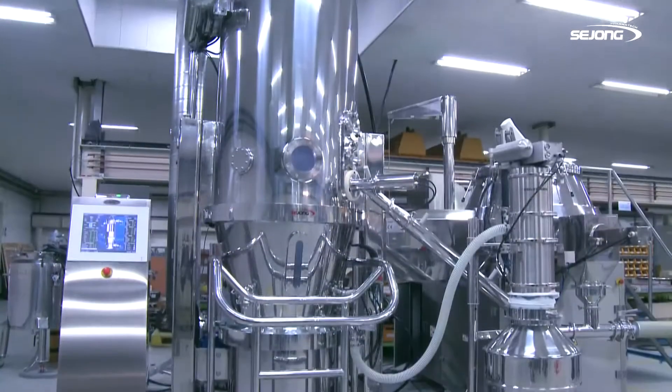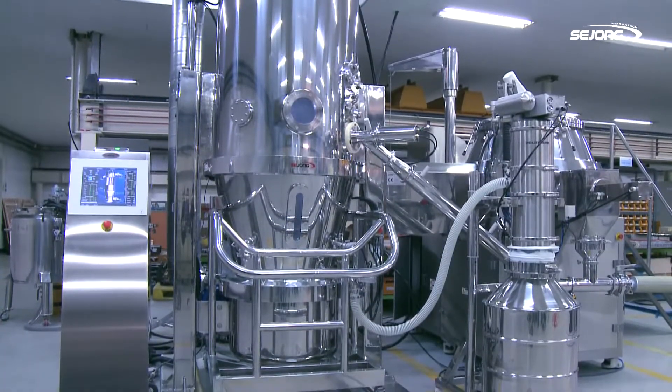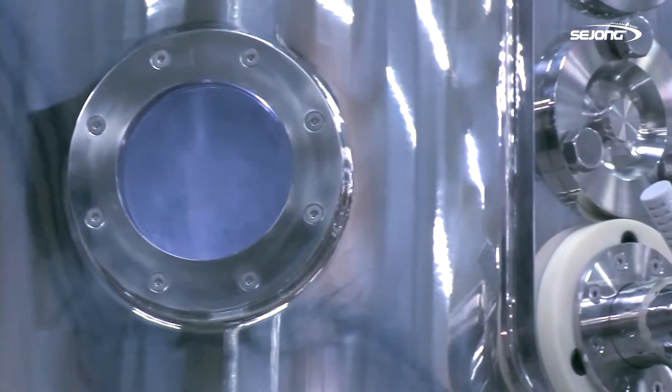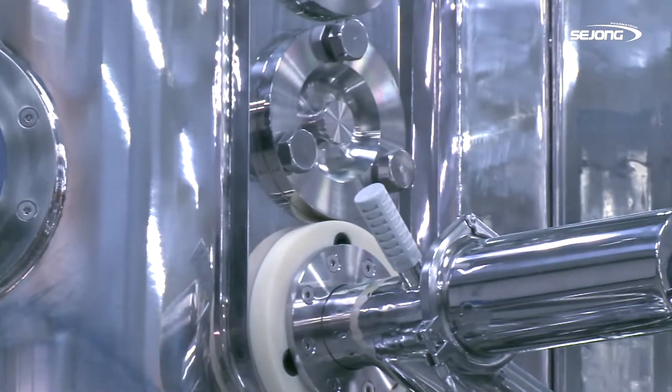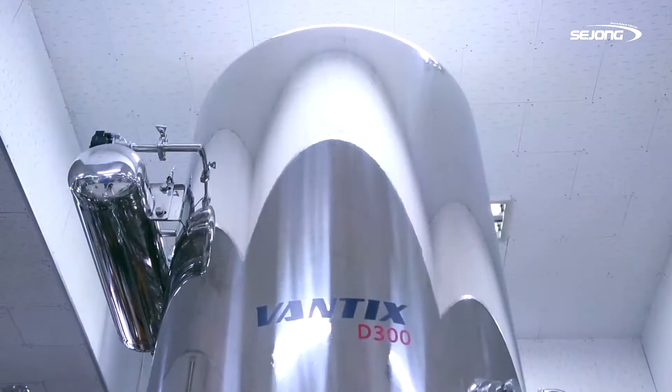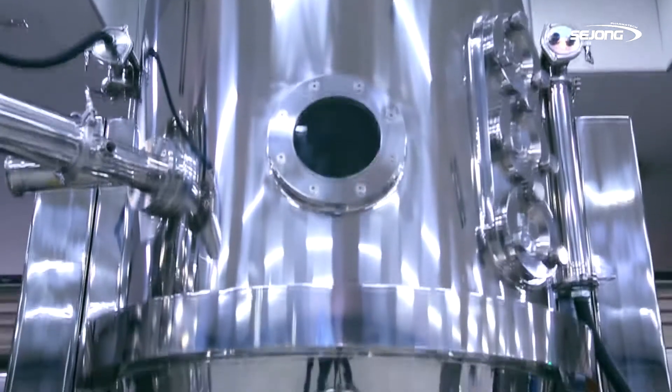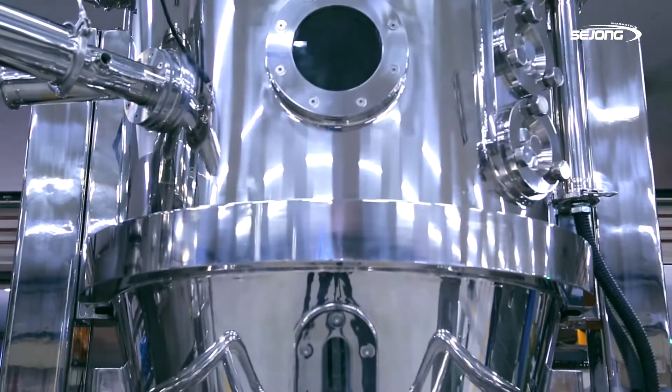D-Series has been designed on the basis of the concept of solid and smart. D-Series considers safety and convenience for the operator as the most important thing. It is based on a European type of pressure-resistant design, and that makes this system more stylish and solid.